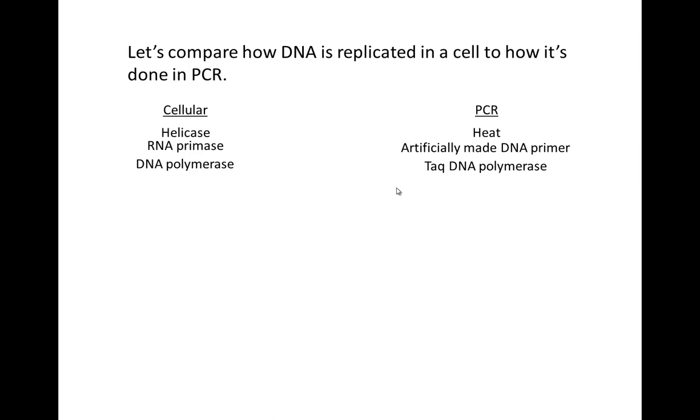This is an organism that evolved in the hot springs in Yellowstone National Park, where the water temperatures get very close to boiling, if not boiling itself. That means these organisms needed a protein, because this is an enzyme, a protein that won't denature under extraordinarily high temperatures.